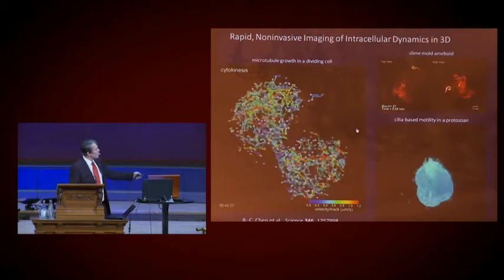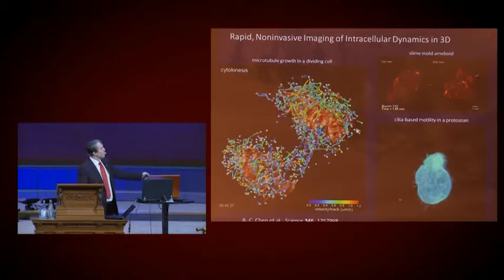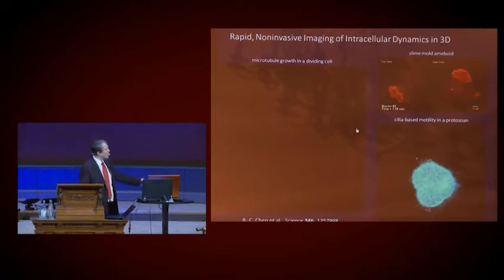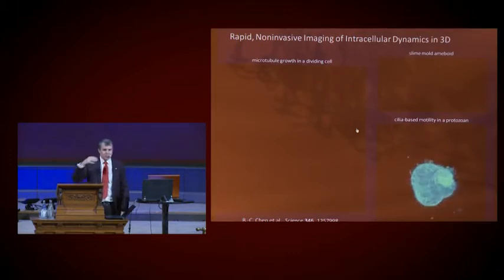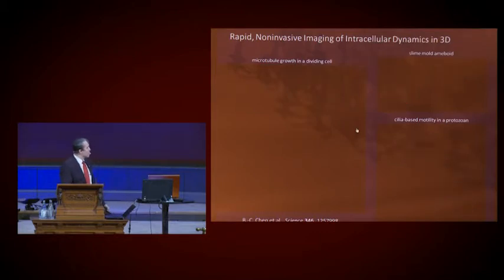This is an example of looking at another light-sensitive specimen, Dictyostelium, and showing an unexpected feature in actin, which is these sort of lightning bolts that you see here, which we now find common in Dictyostelium. And finally, this is looking at a protozoan such as you'd see in a pond, Tetrahymena. He's trapped in a little pocket of agarose and frantically trying to get free, and so you can watch the beating of the cilia as he does that and get the mechanotransductive forces by looking at those.